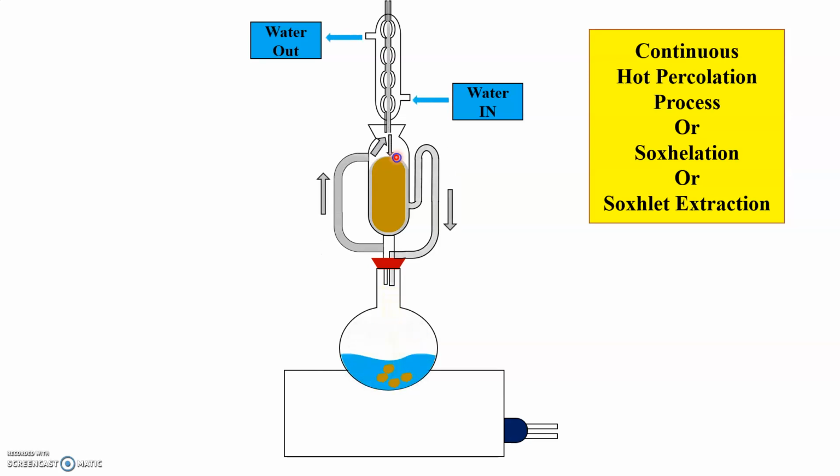Then when the extractor gets filled with the solvent, the level of siphon tube raises up to its top.